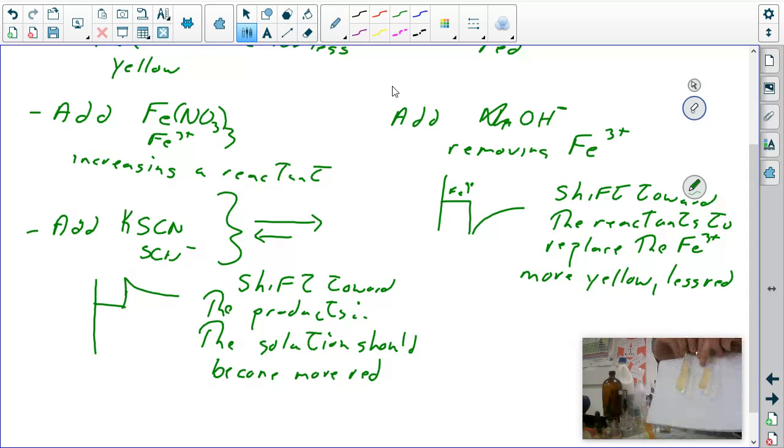Maybe one of you ladies with much more fine eyes for picking out color could see more of a difference. I see a little bit of one, but that may be just me trying to feed my expected results into the actual results. Okay. Now let's just go back to that SCN one where we added the SCN negative. Now this is very, very hard to see.